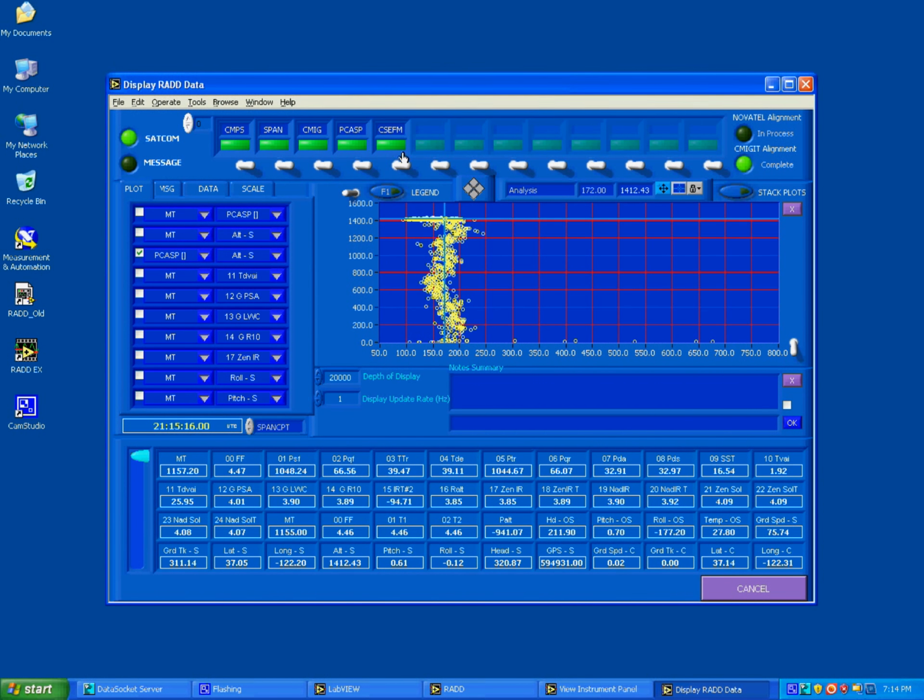Towards the bottom of the window is a series of numbers representing the summary data from the analog signals and instruments connected to the data acquisition computer. The data acquisition shown here represents the same data available for the graphs above. The slider switch on the left side of the window will reveal additional data.